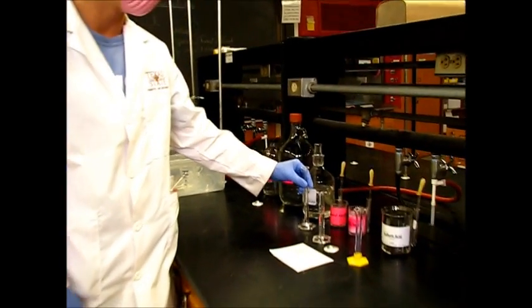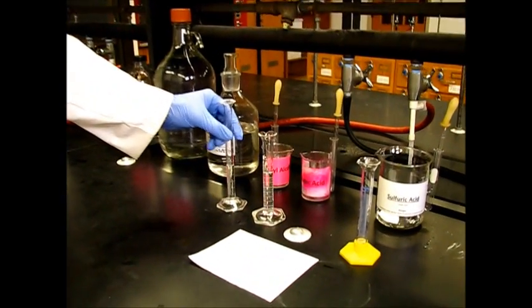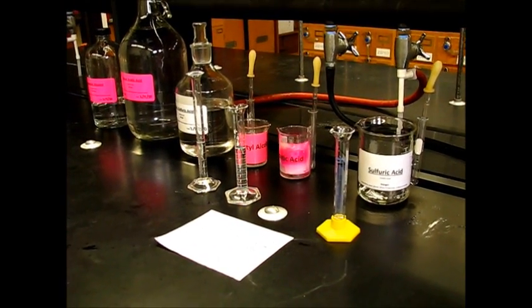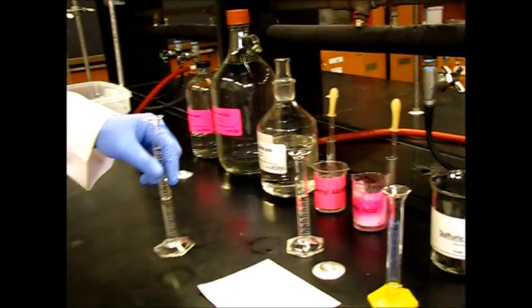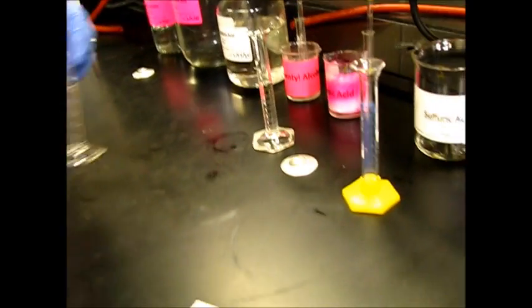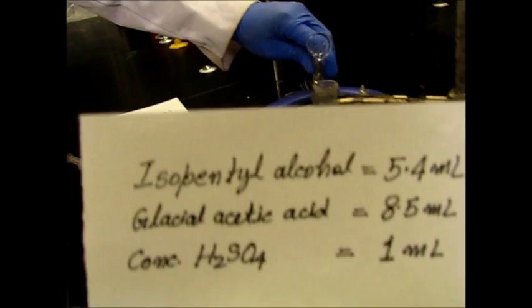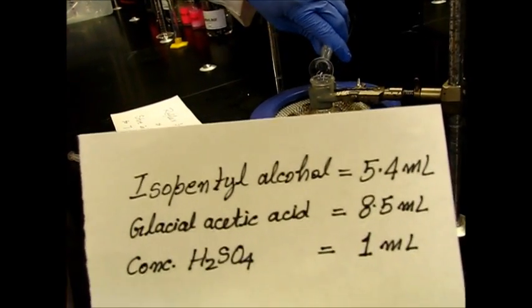So here we have measured out 5.4 milliliters of the isopentyl alcohol, 8.5 milliliters of the glacial acetic acid, and one milliliter of the concentrated sulfuric acid. So we're going to go ahead and combine everything in this round bottom flask. We already have two boiling stones in there. Those will be important once we start the reflux.